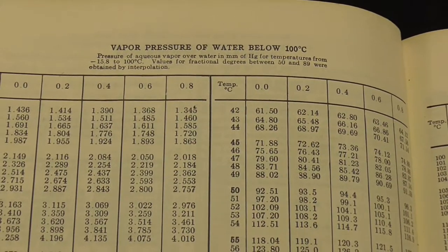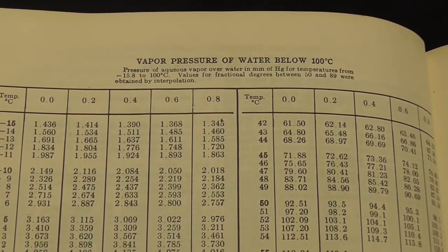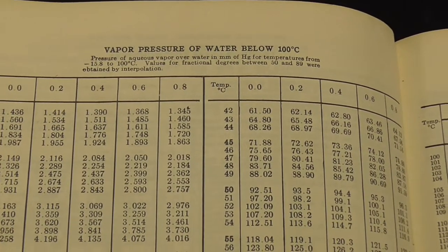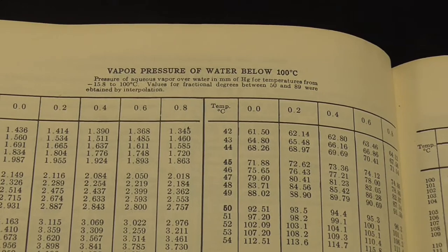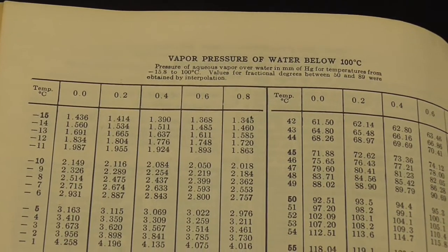Also you see in the lab manual it says we need to get the vapor pressure of the water, and so we're looking at the appropriate page in the Handbook of Chemistry and Physics. You see at the top of the page the titles of the columns, temperature, and then 0.0 and 0.2 and so forth.